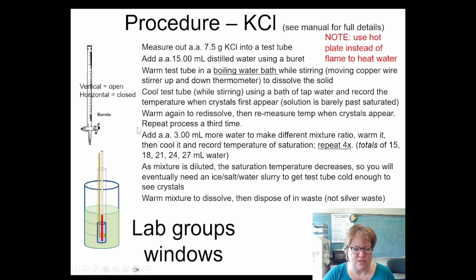Note that in here we have this stirrer. This orange thing is like a stirrer that fits around the thermometer. We'll be using analog thermometers. They're a little bit better with temperature change. And you're going to be stirring it the whole time by lifting the stirrer rod up and down and making sure it's staying well mixed.